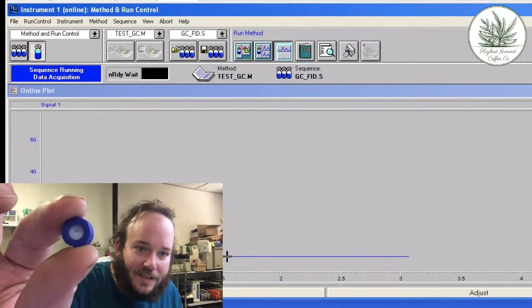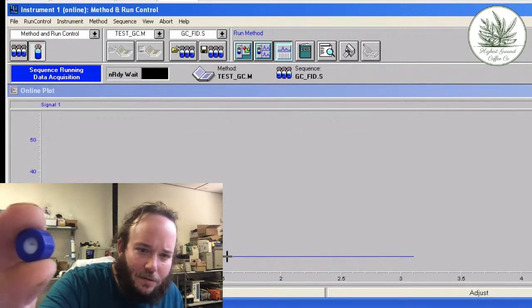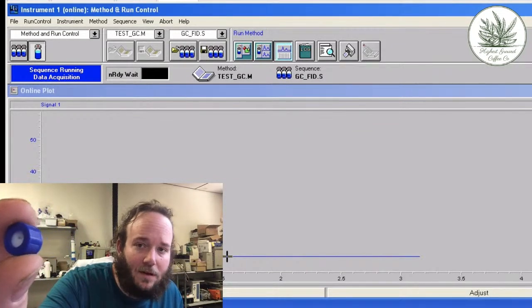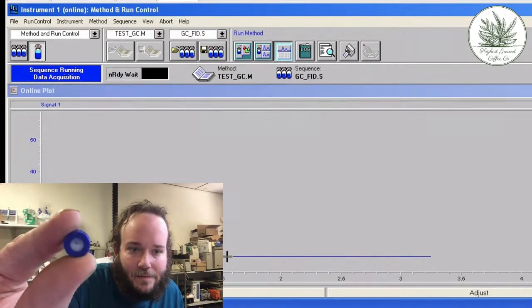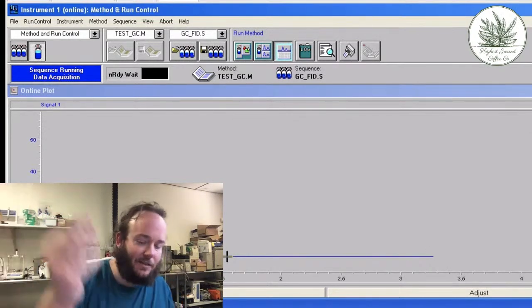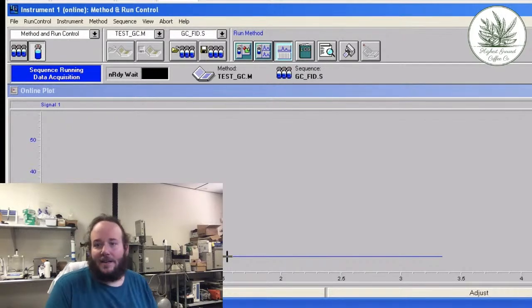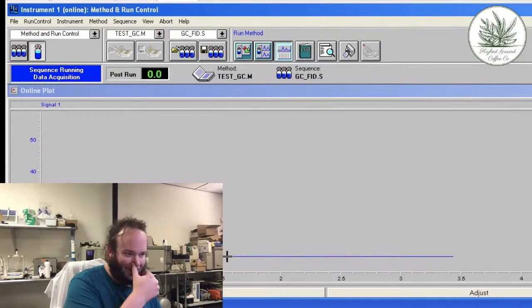If you can see that, that's just from the needle having gone in here probably 4 or 5 times now. Well, 7, 8, maybe since we screwed it up. Yeah, I can almost see through, like, a gap of light. So that's not good. That's just going to let the solvent evaporate. Not what I am going for whatsoever.